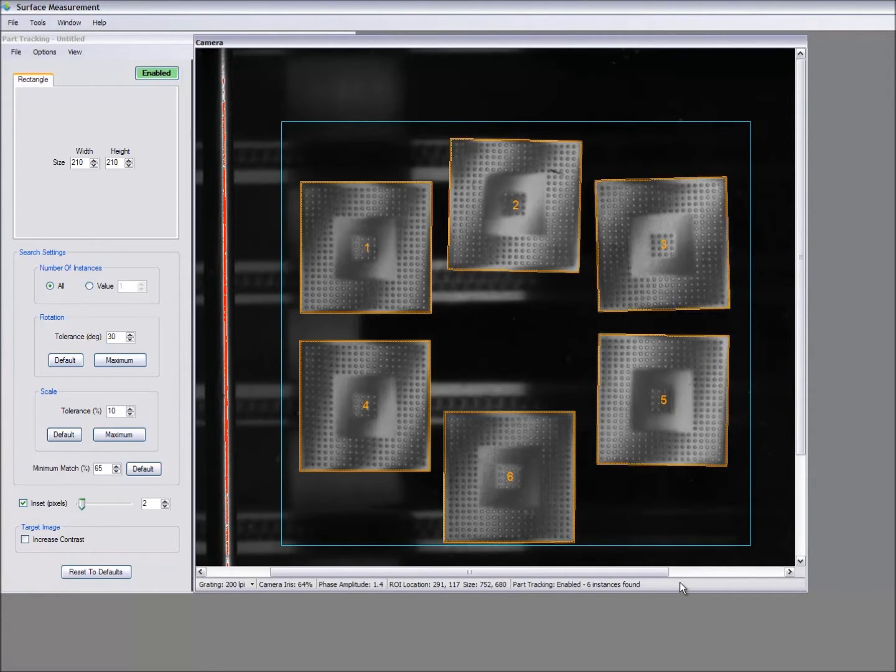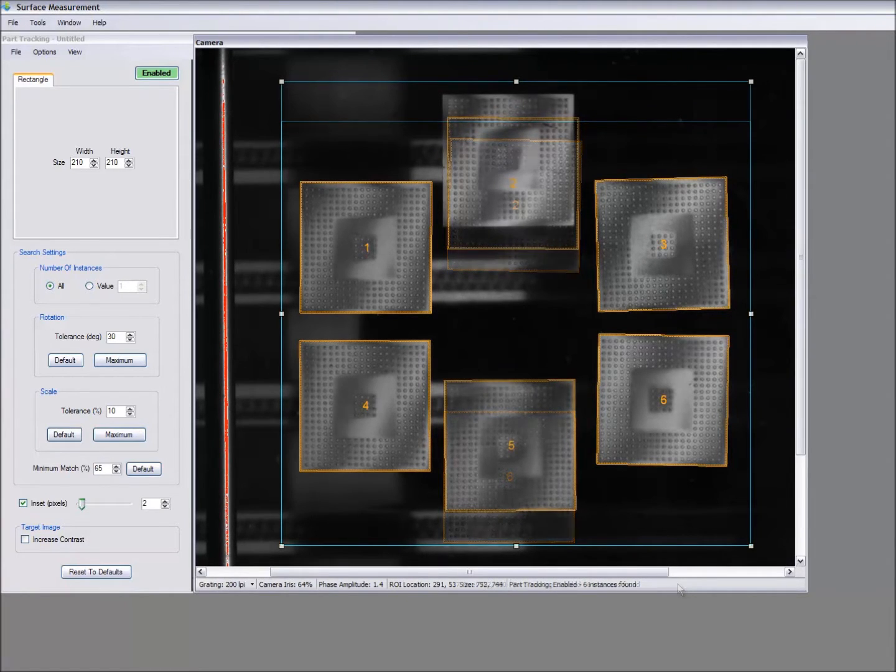For example, when we move the 2 center parts, originally numbered 2 and 5, it can be more difficult to say where one row ends and another begins. In the first example, the top center part is still part of the first row, but the bottom center part is now made its own row and is now labeled as part 6. A part's location in the camera window is based on the top left corner of the part. The rows are established based upon 50% of the rectangle model size.